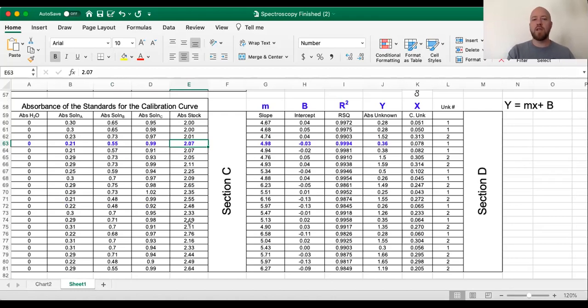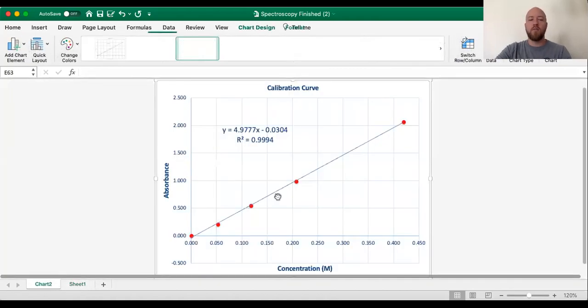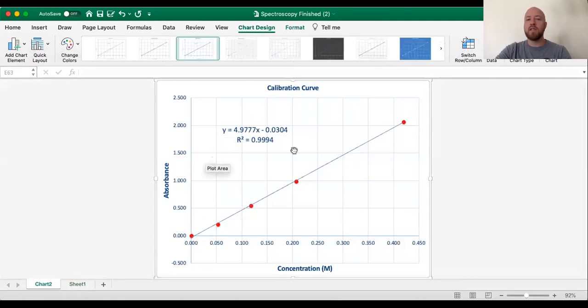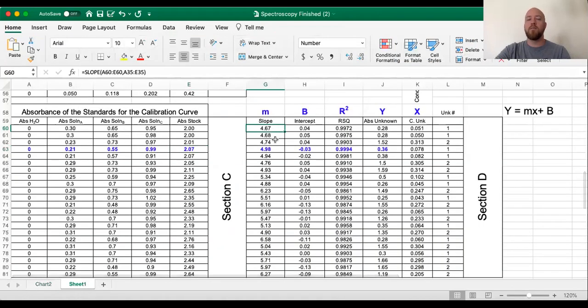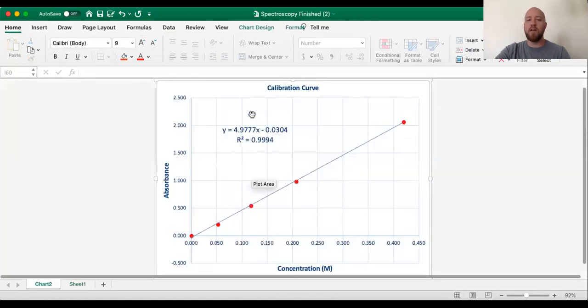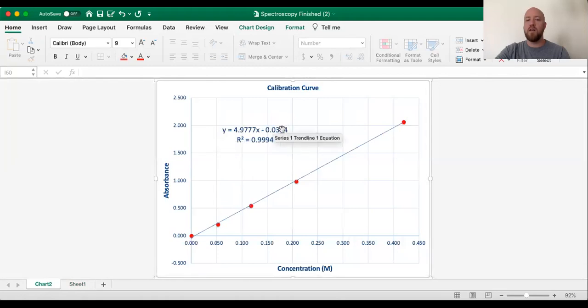It would simply keep the numerical values from the graph. We did a graph in the physical properties lab as part of our data section. We have a sample graph. We know what the graph looks like. But this is one data set. So we don't do this for every data set. So instead, we record the slope, the intercept, the r-squared value. So these are the values that the graph would give us. The slope, the intercept, the r-squared value.